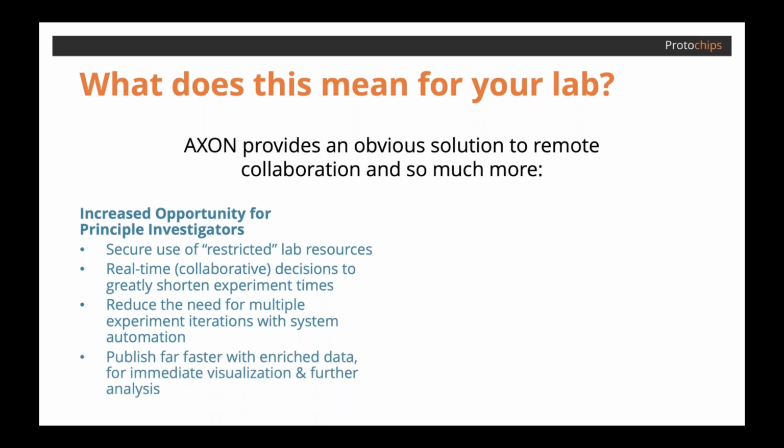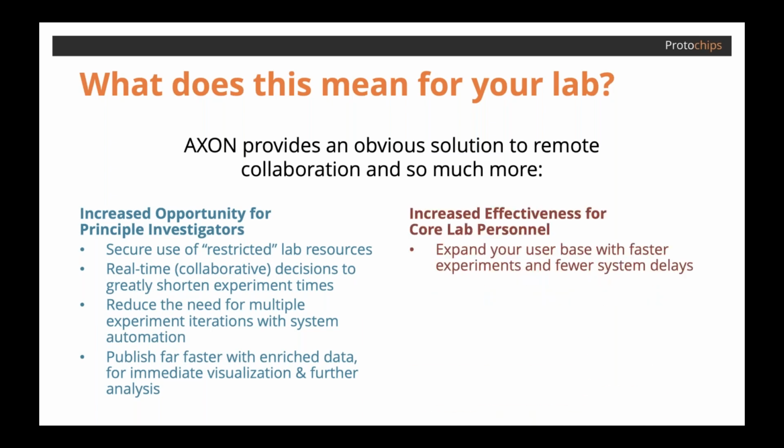Your data is much more rich, and you're able to create immediately different types of visualizations to share and to present and for further analysis. There's an opportunity for increased effectiveness and efficiency for core lab personnel as well. You're able to potentially expand your user base because your experiments are faster, there's fewer system delays.